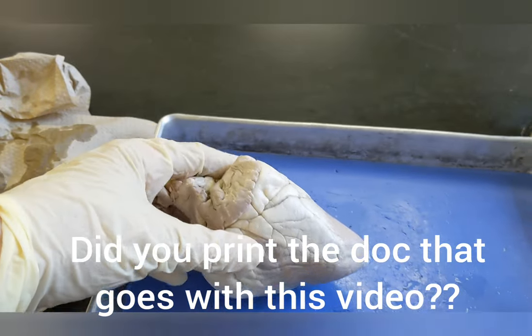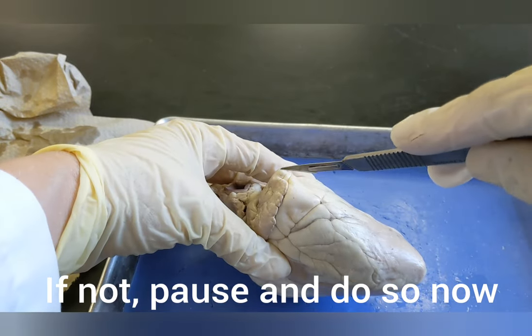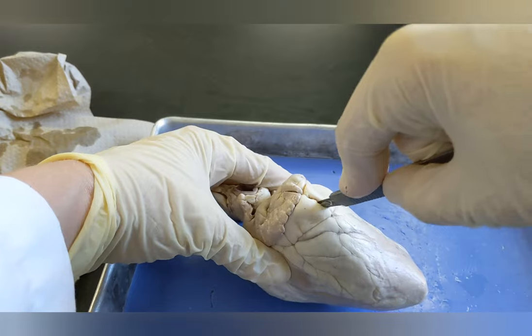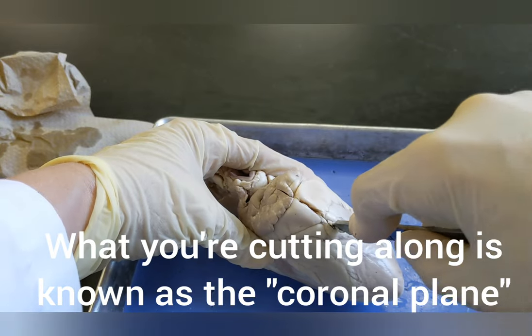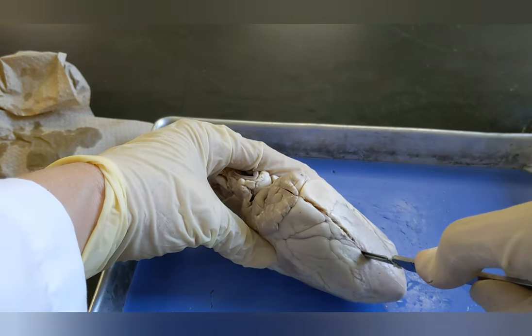I'm now going to bisect the heart — 'bi' means two, 'sect' means to cut. So I'm going to cut the heart into two pieces using my scalpel. You want to find its midline right down the middle as best you can, and cut to the apex to separate the front of the heart from the back of the heart.